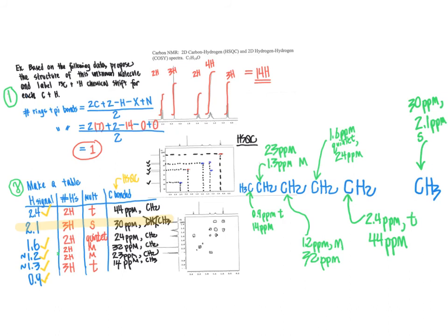Now comparing this to our molecular formula and seeing what we have left in terms of the parts and pieces, C7H14O. So we need to plug in here definitely an oxygen. At this point we are missing an oxygen. And we are also missing one carbon atom because we have 6 carbons sketched out here. We have 6 carbon atoms in the chart here, but there's 7 in the formula. So what that tells us is there is a quaternary carbon that is not showing up in our HSQC spectrum. The reason it doesn't show up in the HSQC spectrum is it is quaternary. It is not directly bonded to any hydrogens. HSQC shows carbon-hydrogen bonds, so a quaternary carbon isn't going to show up there.